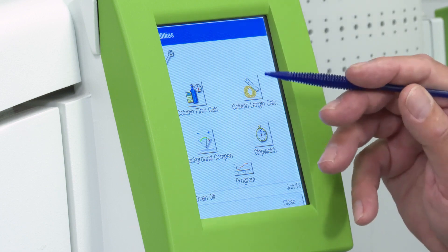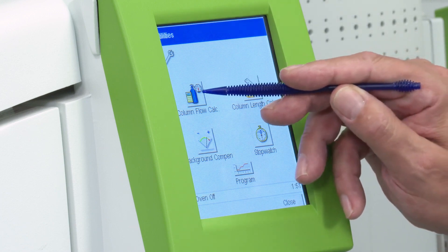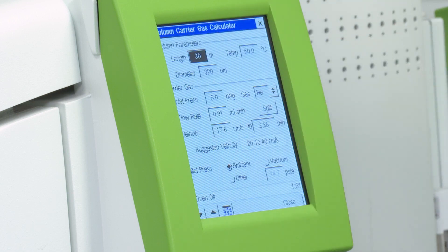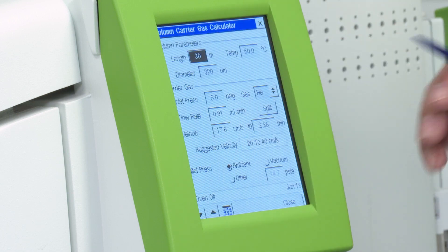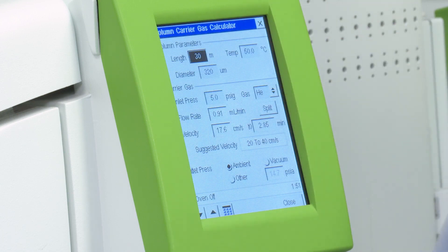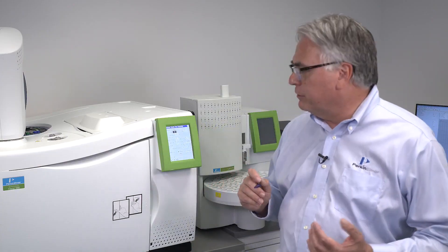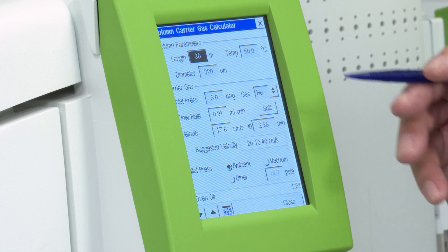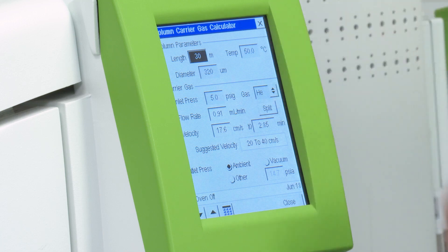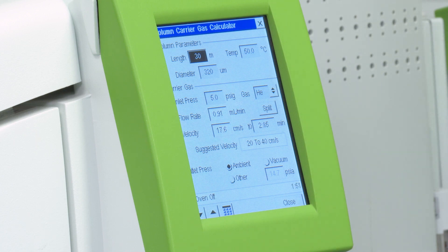The one that I get the most utility out of is the column flow calculator. It's very nice. This doesn't have any impact on the underlying functionality of the instrument — this is simply a little calculator for your edification. What we can do here is we can put in parameters such as column length, column diameter, temperature, carrier gas, and solve for the three interesting flow parameters that we want to know.